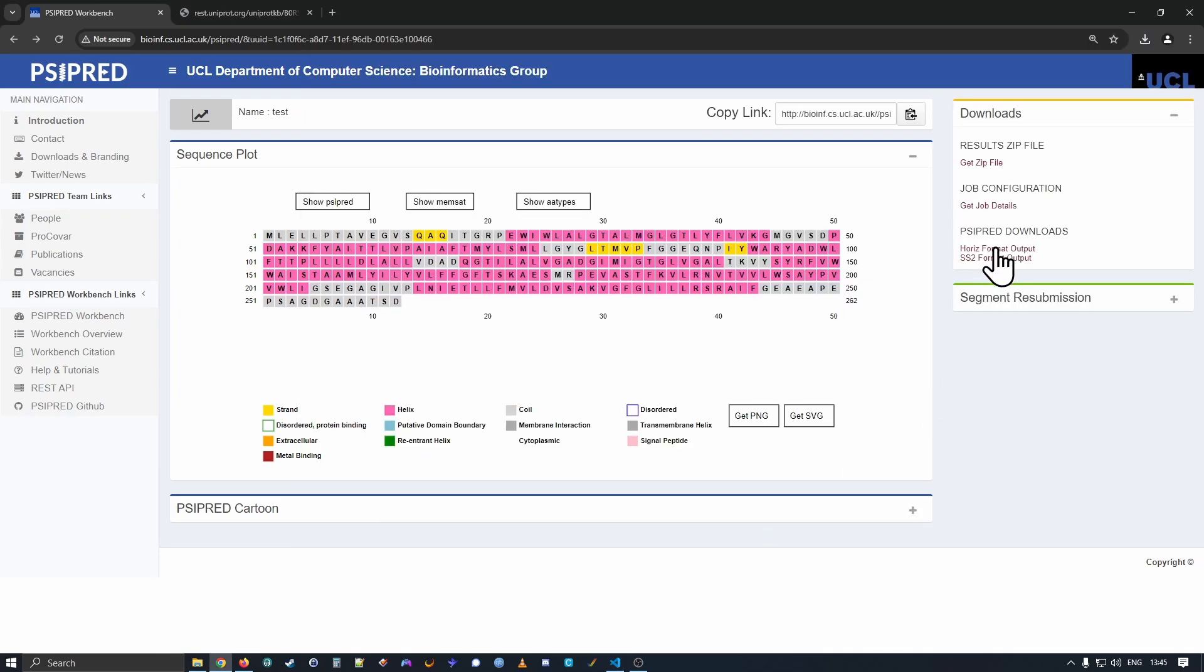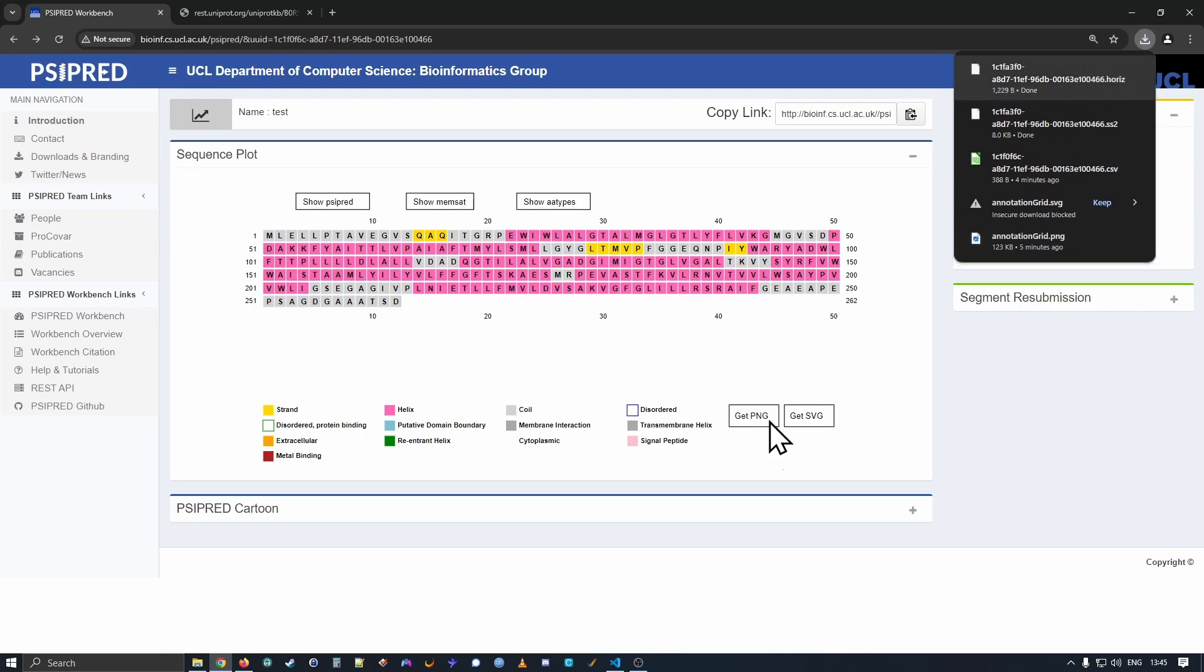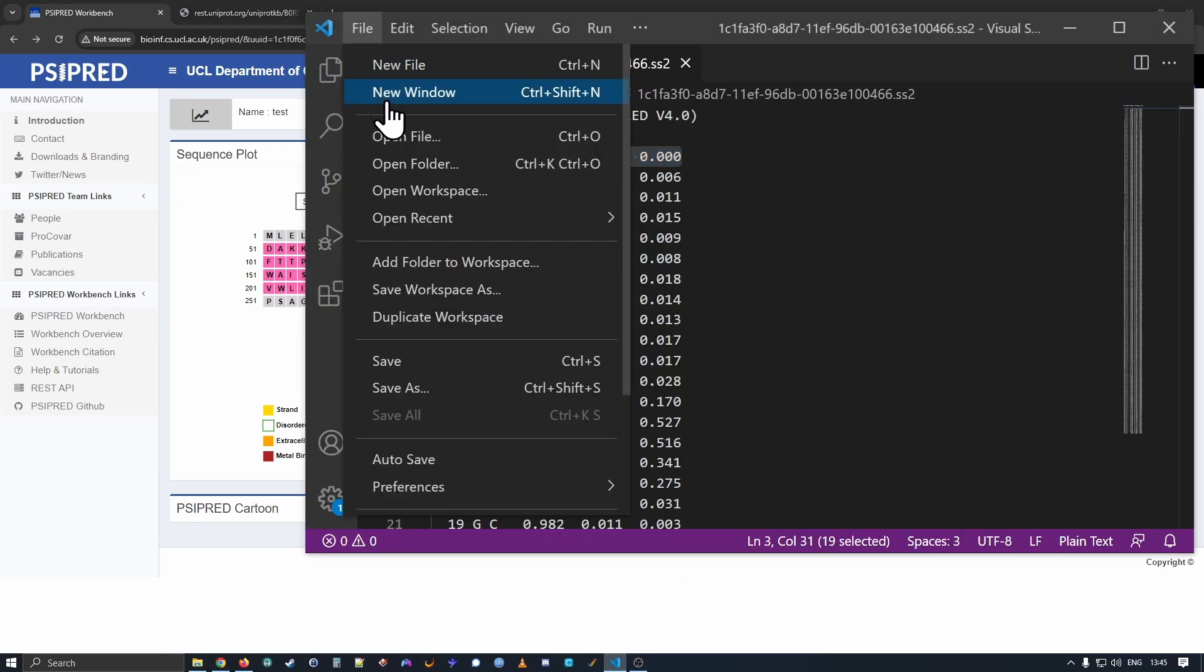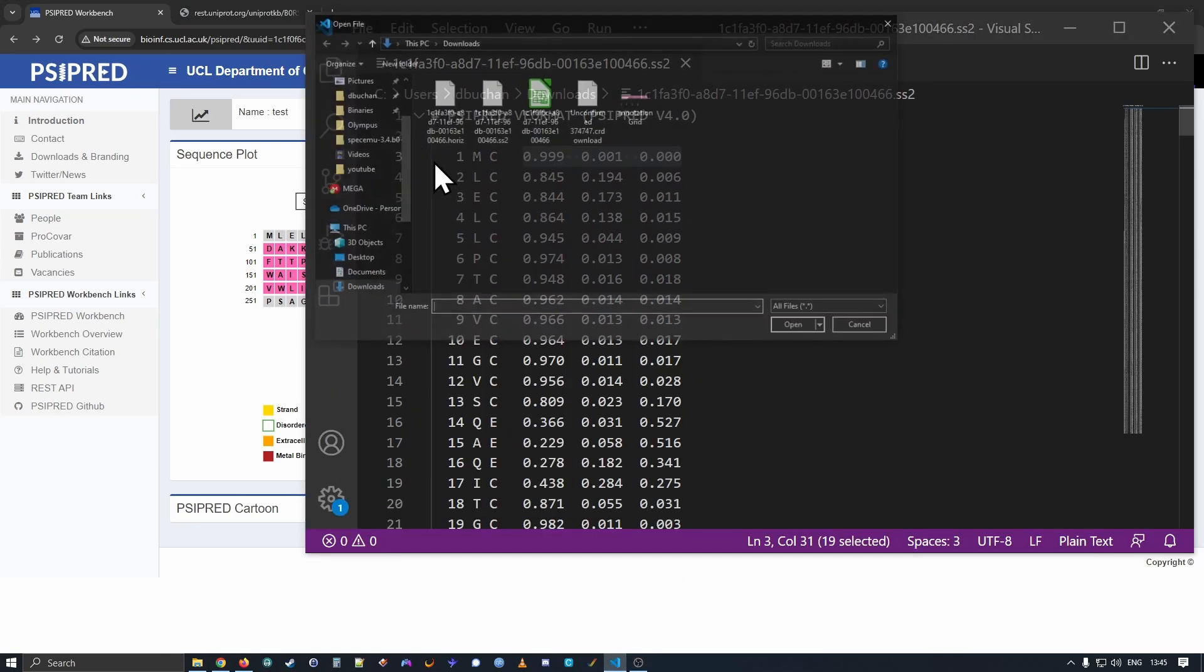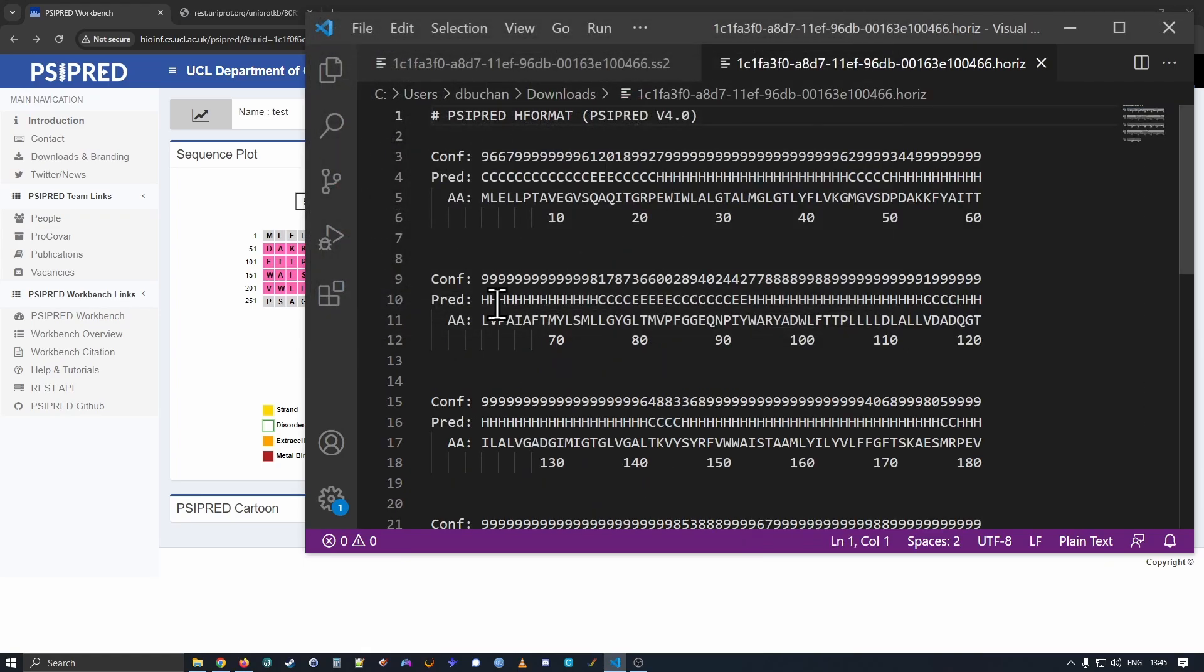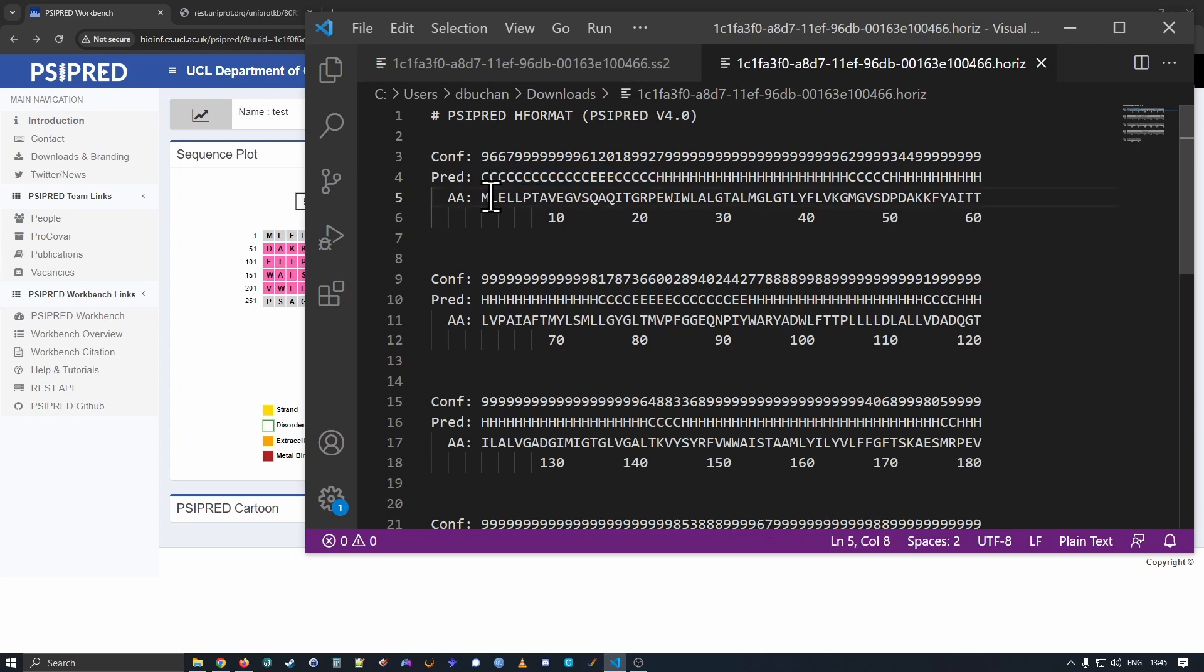Next, the horizon format. This is the final output from the last step. Using VS Code, I can open this. And here, this is very similar to the SciPred cartoon. We have the final confidence scaled from 0 to 9. So that's 10 positions. We have the final prediction at each position. And we have the amino acid sequence you submitted.